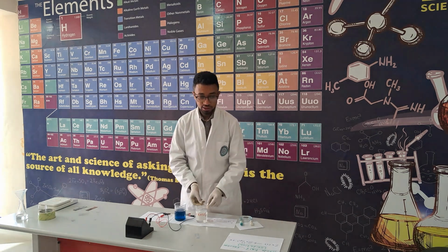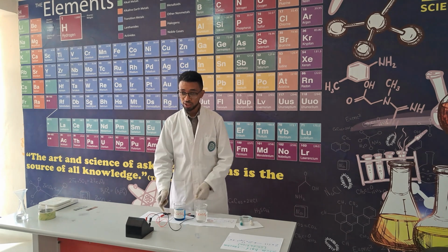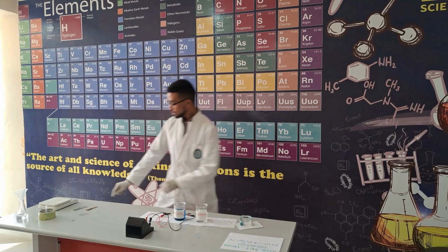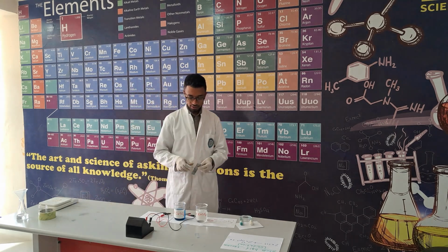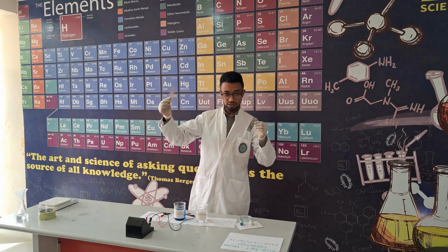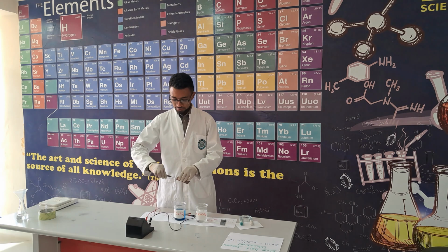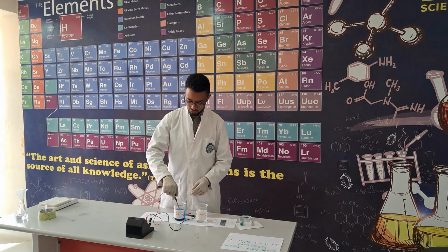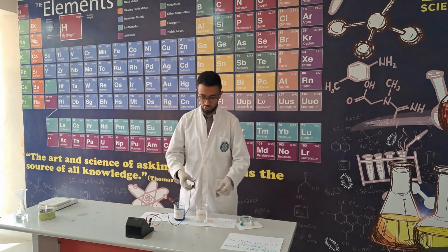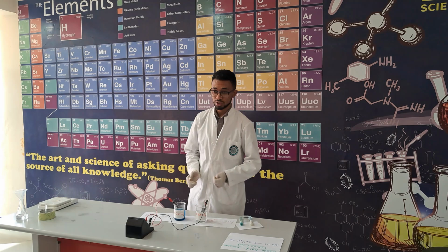Can you read this? This is 1 molar zinc sulfate solution, and this is 1 molar copper sulfate solution. So we're going to have two compartments, and two electrodes here. This is the copper electrode, this is the zinc electrode. You can tell from the color, right? The copper electrode will be immersed into the copper sulfate solution, and the zinc electrode will be immersed into the zinc sulfate solution.